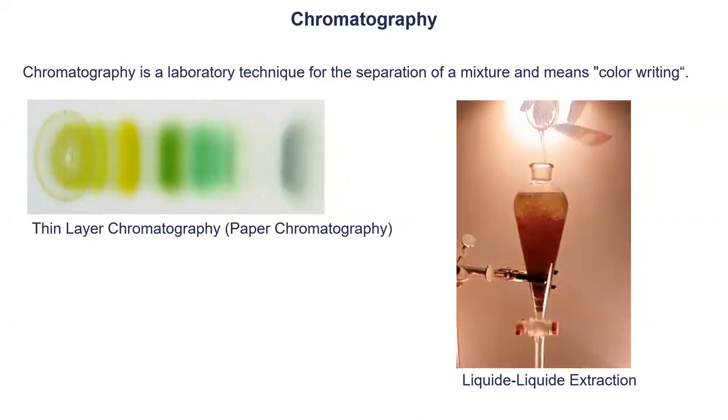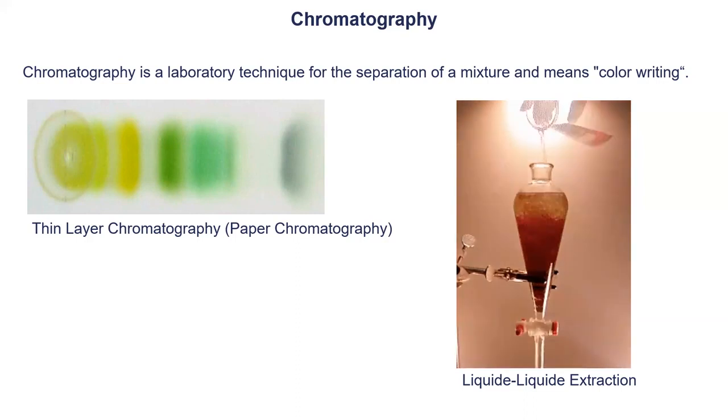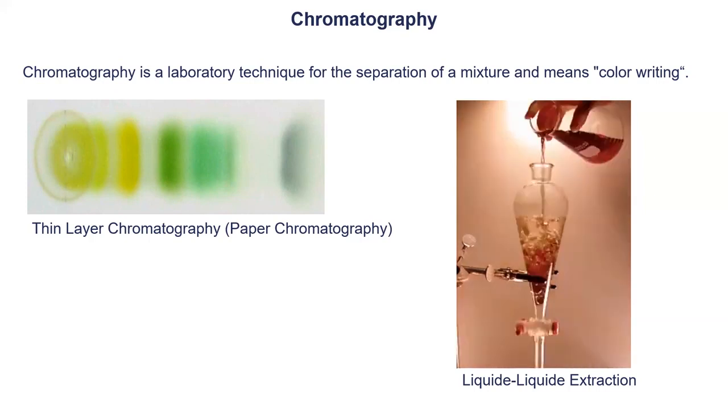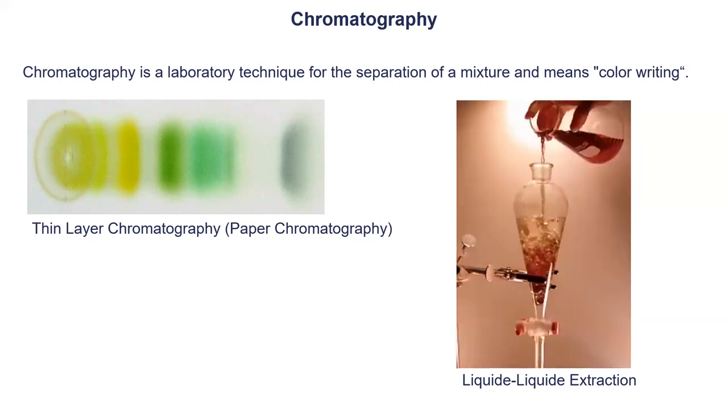Of course, you need to know where your compound will be in the end to get your compound for the analysis. One nice thing, for example, if you have a compound that you can charge with a buffer: if it's neutral, you can have it in the organic phase. You take the organic phase, then you take the buffer to change the pH in the water phase. Then you charge it, and then it will be in the water phase. So you separate it from a lot of stuff based on this technique already.